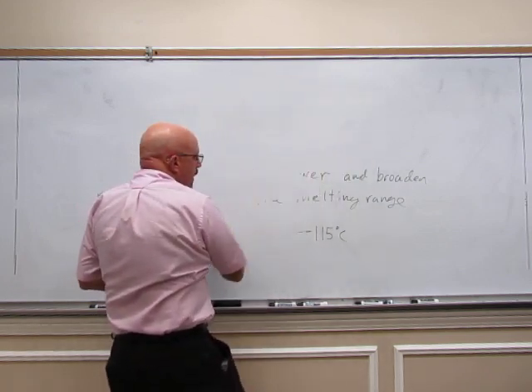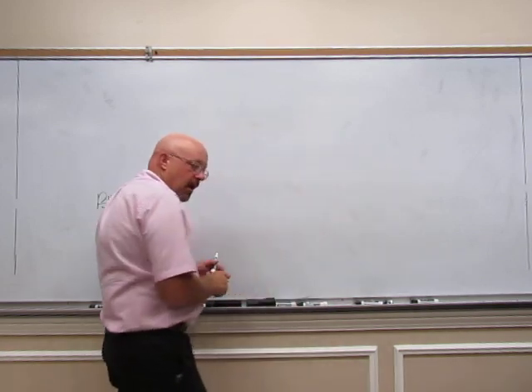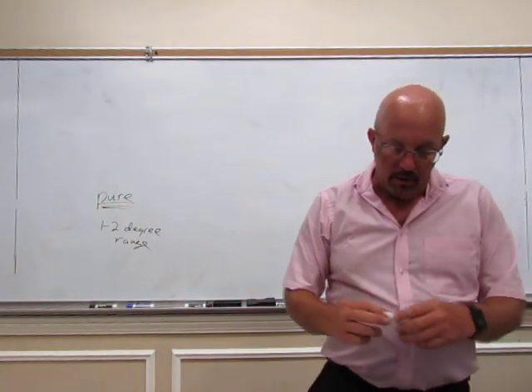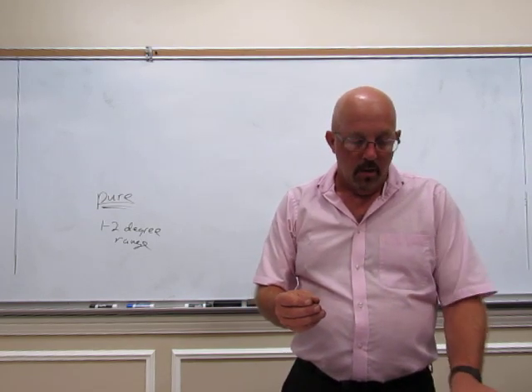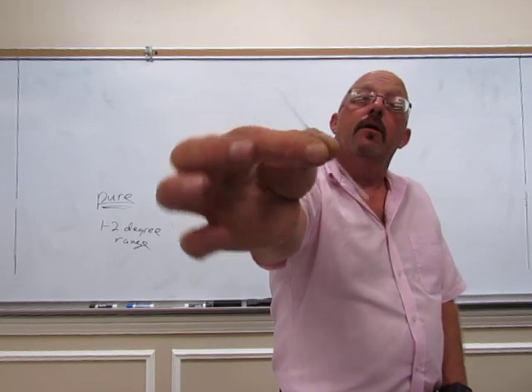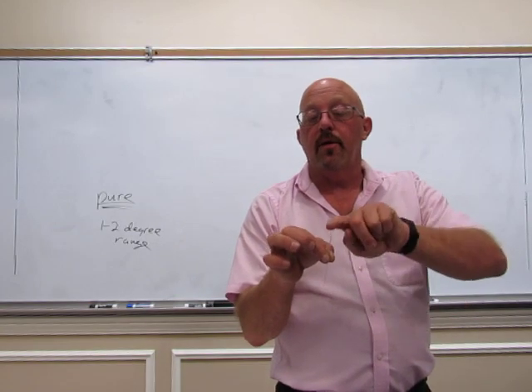Now, to measure melting points, we have melting point apparatuses in the lab. You are going to use a melting point capillary tube. Hopefully you can see this. It's just a little tiny tube. One end of the tube is open, one end is closed.